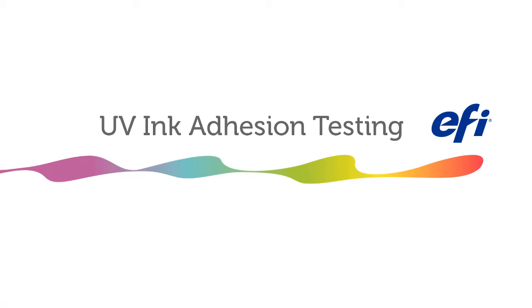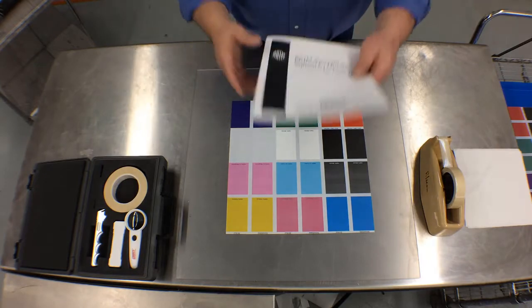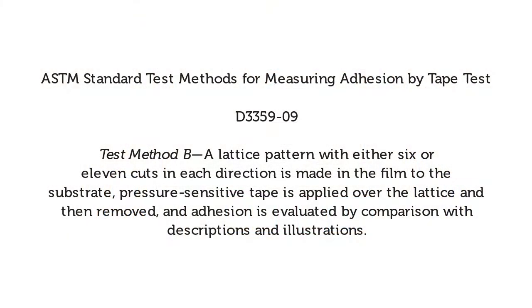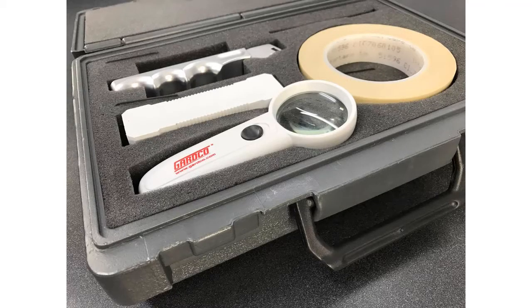UV ink adhesion testing: how to perform crosshatch testing for UV ink adhesion. EFI utilizes the ASTM standard test method for measuring adhesion by tape test with the designation of D3359-09, specifically test method B. The kit used in this video is from Gardco.